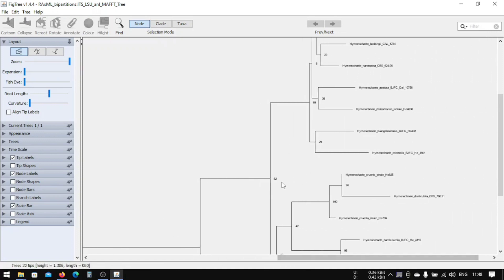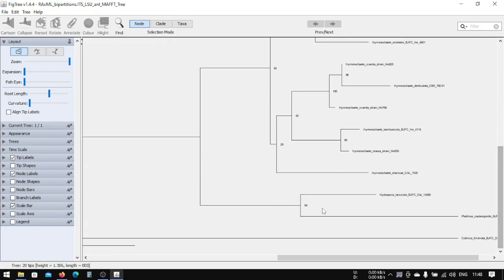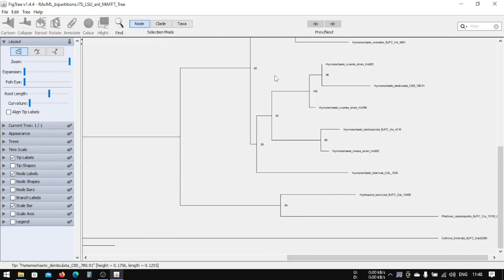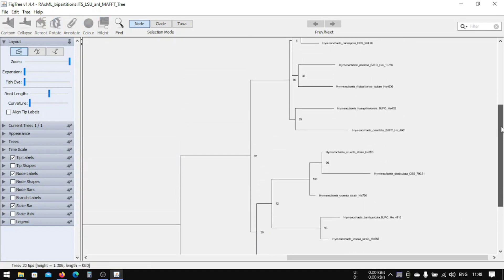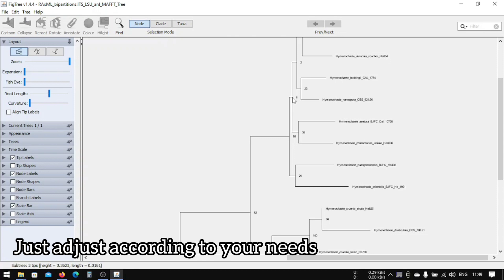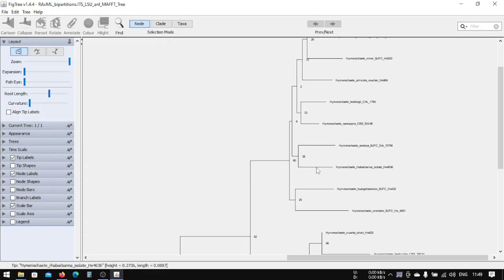You can see the support value here — it shows 82, meaning 82% support out of 100. You can also see 94, so these two branches are supported by 94. Others show values like 99, 100, and 96. The value 42 is lower, so this branch has a lower support value. There is also a value of 8, so these three branches may not be well-resolved and could cluster together.